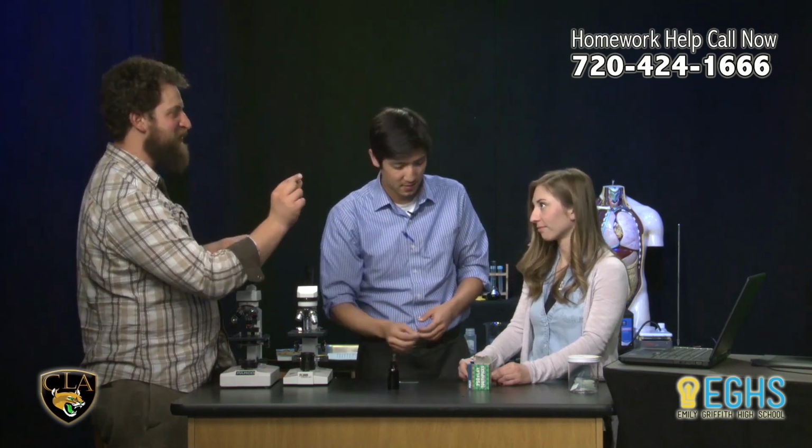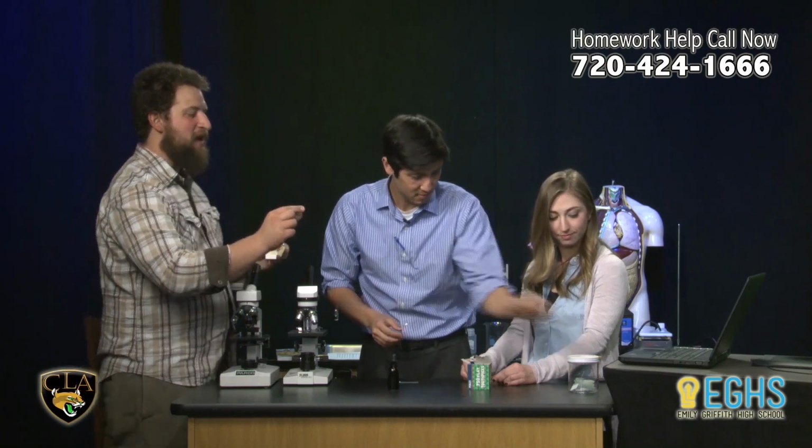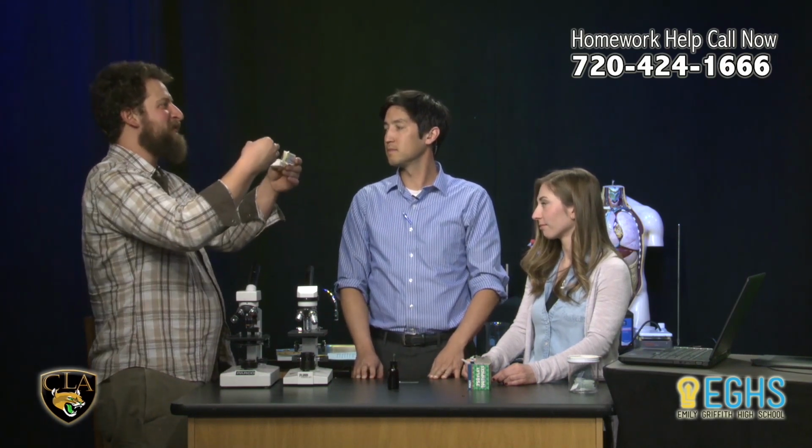Okay, so what I have here are glass cover slips. These are really thin sections of glass. Place this. Microscopes really see in an almost two-dimensional plane. They don't see 3D very well, and so you'll notice as we look at these things, we'll be seeing things in a 2D plane.